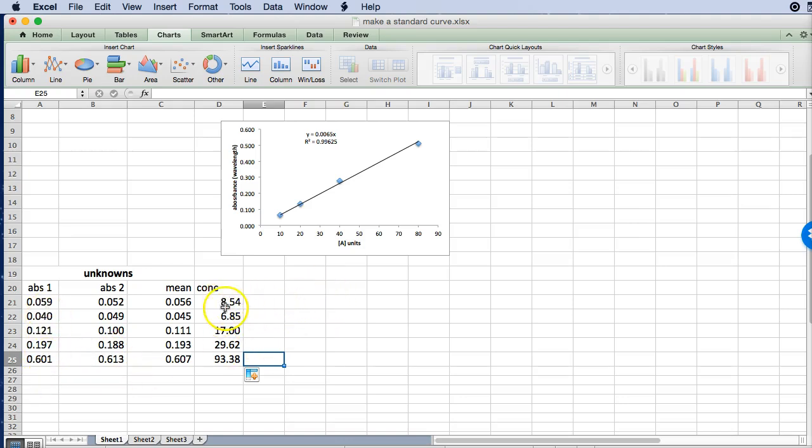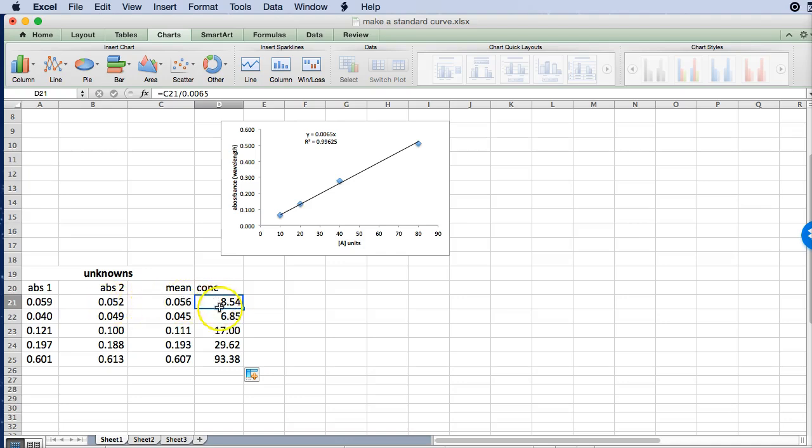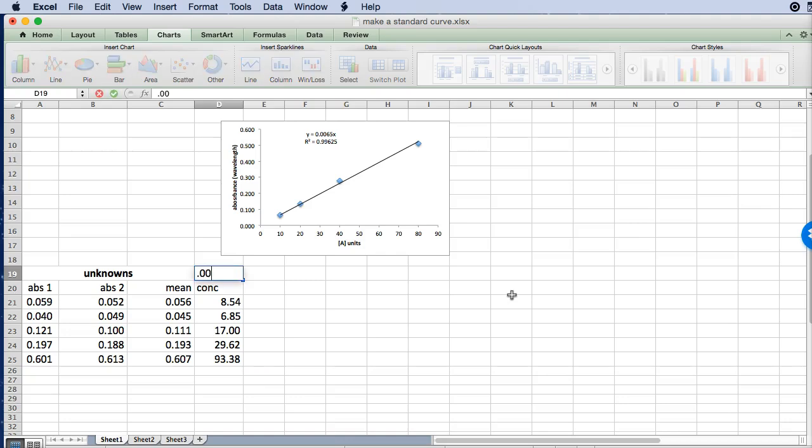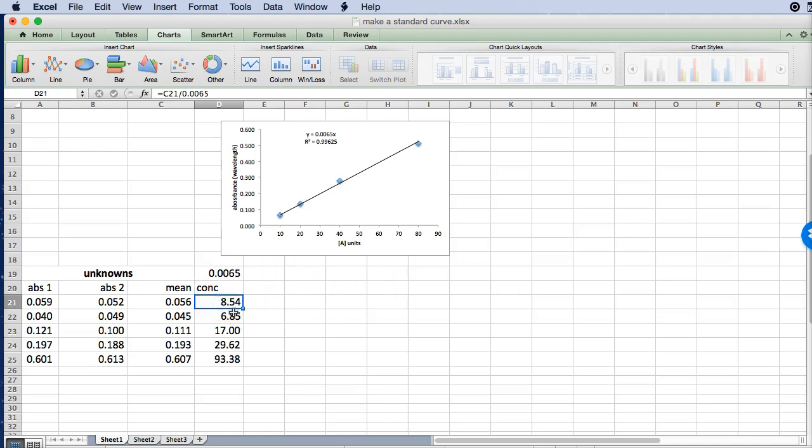Now there's another way to do this that's sometimes useful and that is here we used what we call the relative reference because we've referred to C21 and then we've divided it by a constant value that we got from this graph 0.0065. Sometimes it's useful to put your constant in a cell like this and then refer to it using an absolute reference.